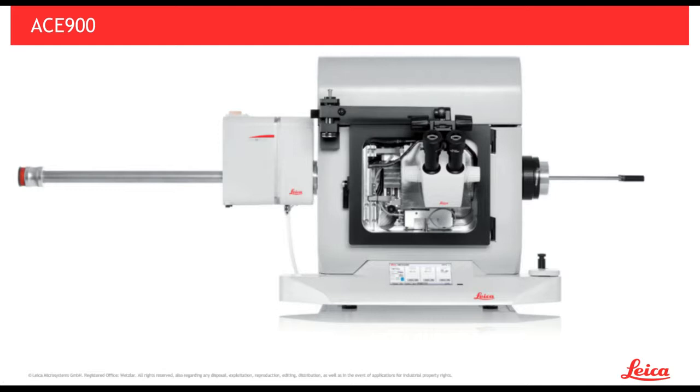So we were trying to minimize the etching to get a single layer of mucins that are still supported by vitreous ice on the back for this study. I think it would be really interesting to look at it through AFM. I don't know how you would image from the side like that. I'd have to think about a way to section appropriately, but you would definitely look from the top and look at the termini at the very least.